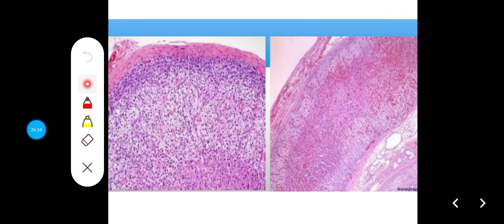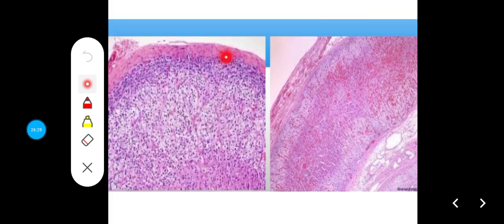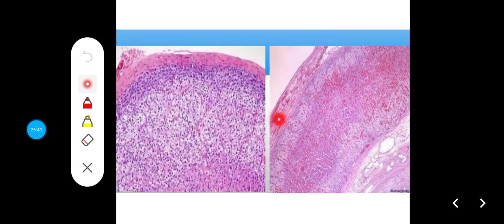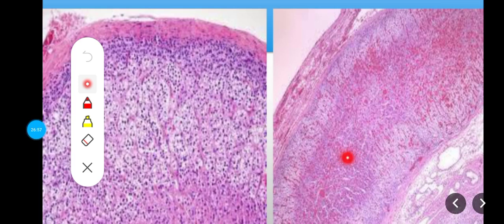But in the adrenal gland, the zona fasciculata, which is in between the zona glomerulosa and the zona reticularis, is much bigger, and it stains poorly. It doesn't stain as much. Now look at this one as well. This is the capsule, which is a fibrous connective tissue. Then this is the zona glomerulosa. This is the zona fasciculata. Notice the much more linear arrangement.